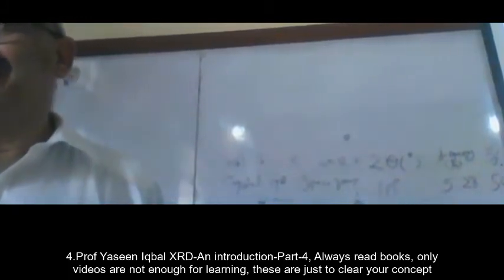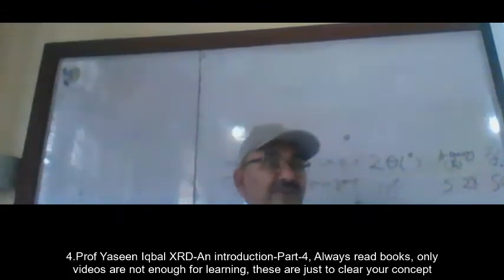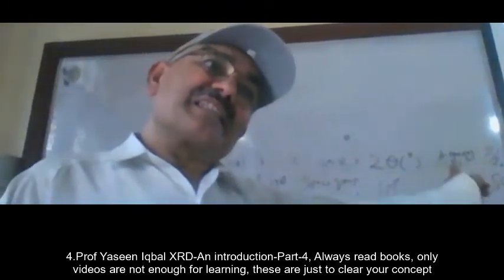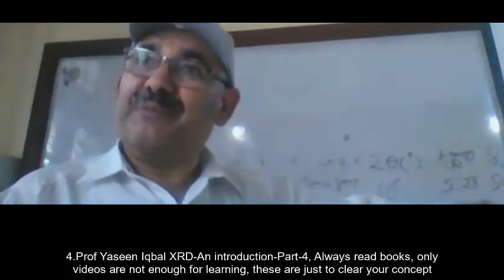People take years in reporting their data in order to confirm it, right? Confirm it, reconfirm it, and reconfirm it. If these three peaks were matching, but this one was not matching, and its intensity is 70 or 30 or whatever it is, then this gives you a clue of a second phase inside the material.